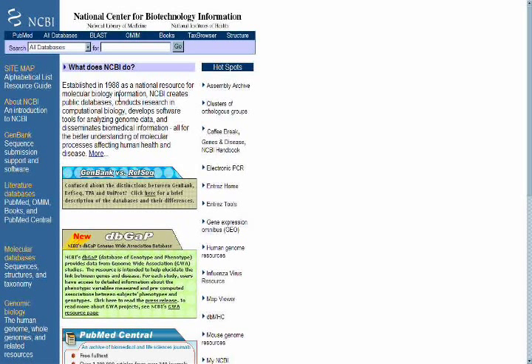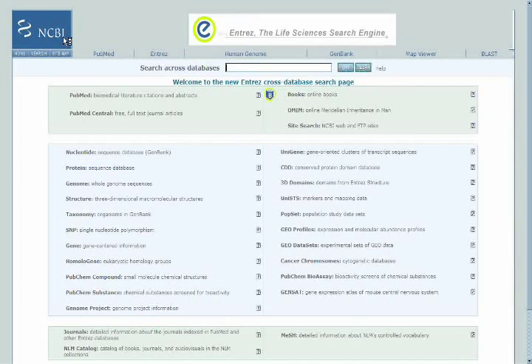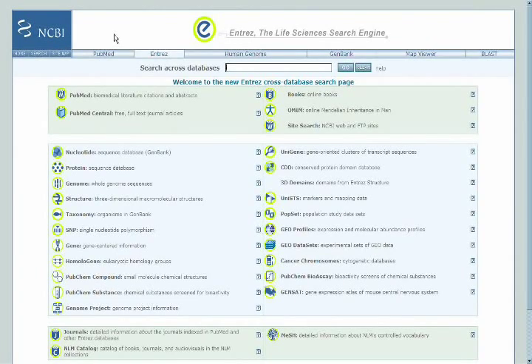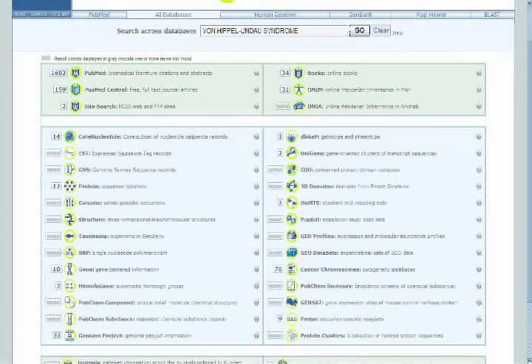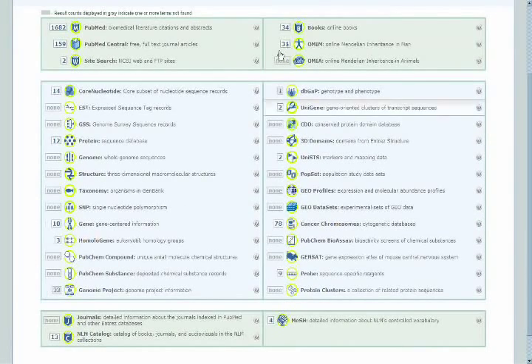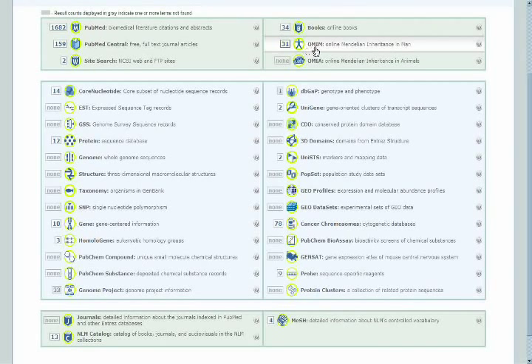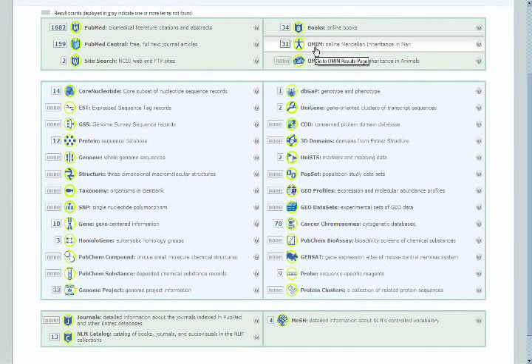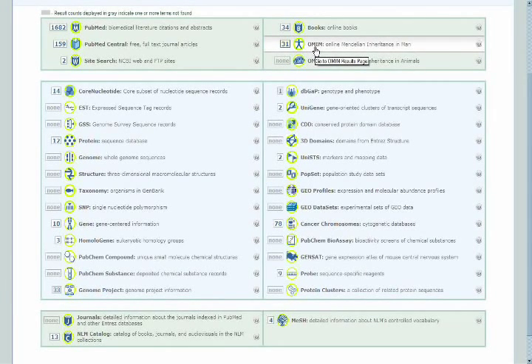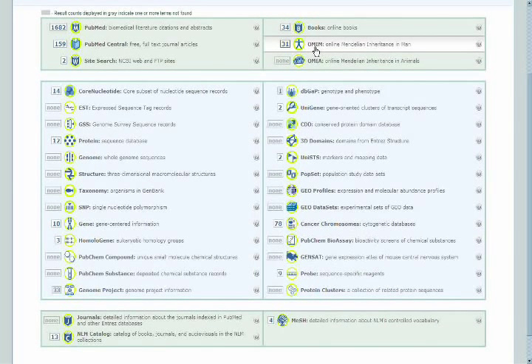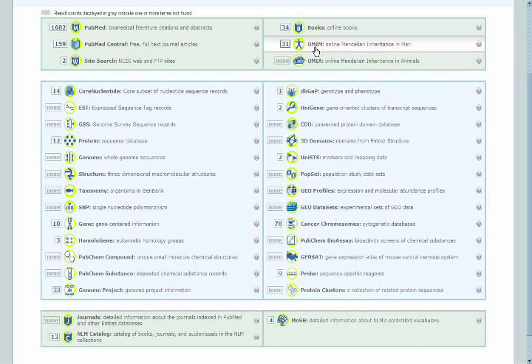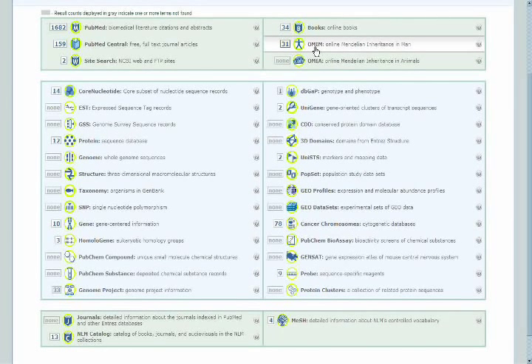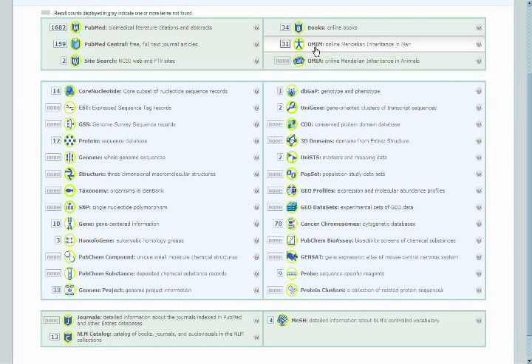We could do a text-centric search directly from the ENTREZ database, which is the All Databases link from the NCBI homepage. We have sources of information, everything from the literature information on PubMed to information about the role of the Von Hippel-Lindau gene, or VHL gene, in human disease, which would be found in the online Mendelian Inheritance in Man, or OMIM, database.